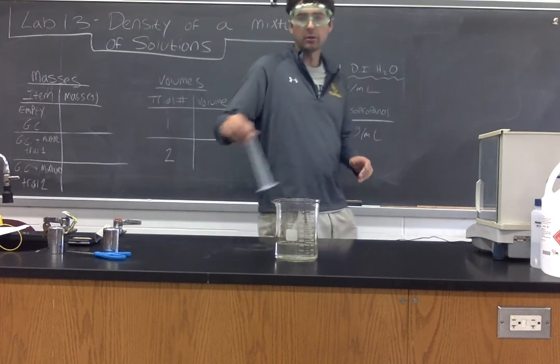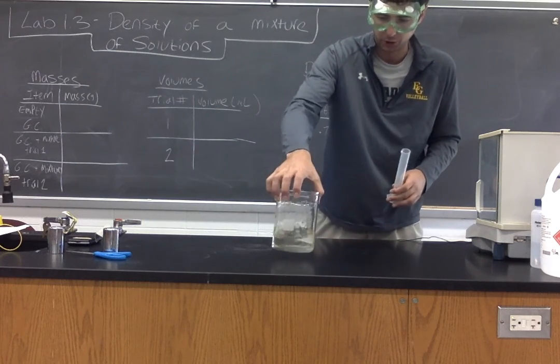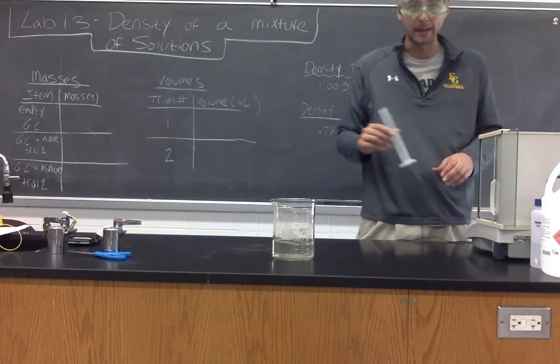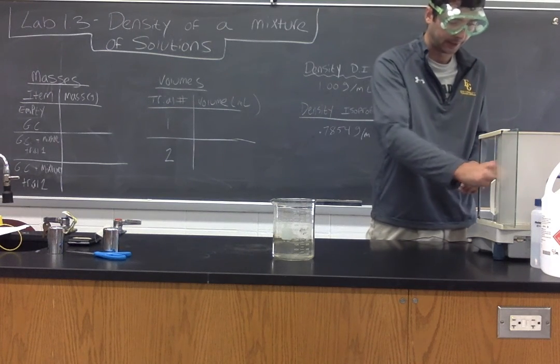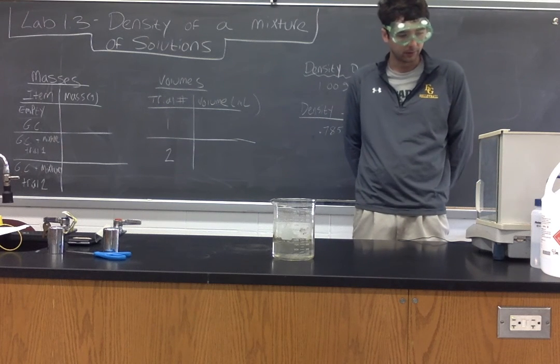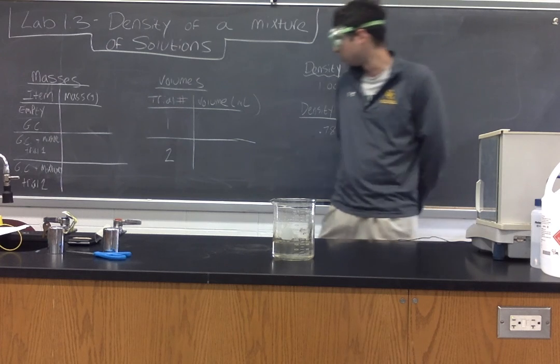So what I have here, we're going to run two trials. An empty graduated cylinder as well as our mixture. What are we going to do? Well, let's first take the mass of the empty graduated cylinder. 25.2721 grams.